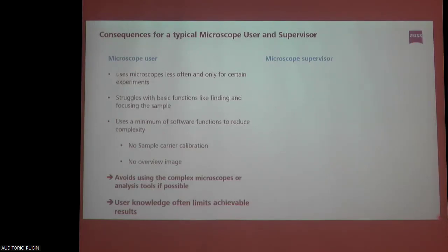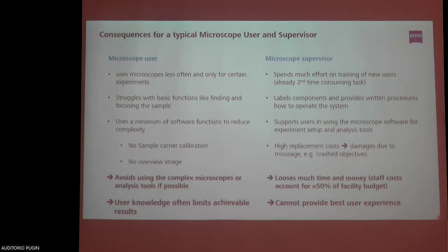And normally for this, we have the microscopy supervisors. But the microscopy supervisors typically face the challenge that they have lots of different microscopes that they have to supervise, and they probably have lots of students that they need to train. And they have results they have to evaluate, they have to do processing, image analysis. So there is not enough time to provide this so-called best user experience for all the microscope users. So that's a big issue.